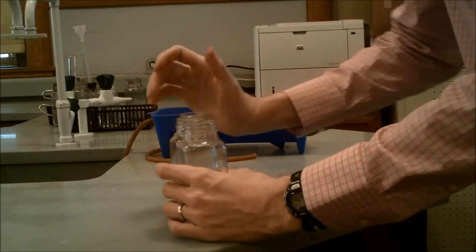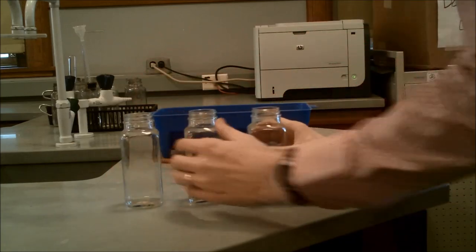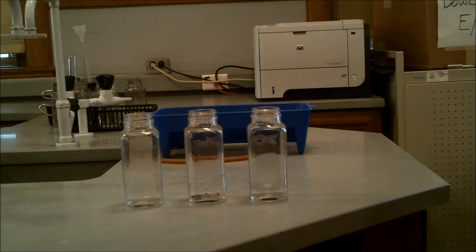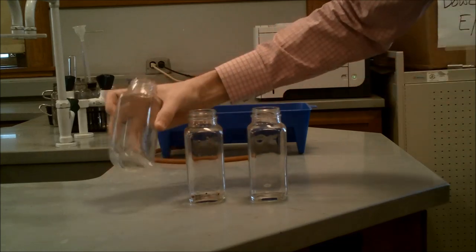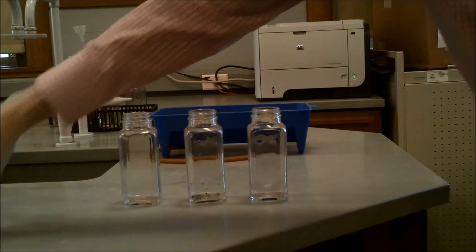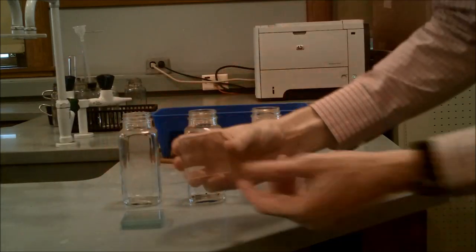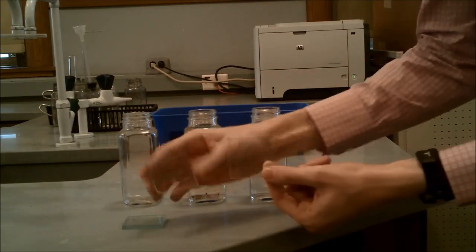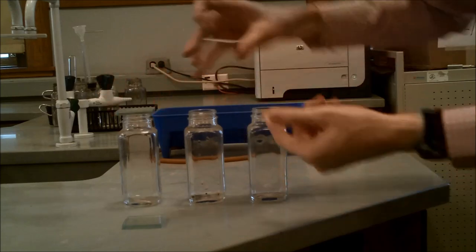The next is the gas collection bottles, the rectangular shaped ones. These will be the ones that you'll fill up completely with water and submerge in the reaction trough. The glass squares are what you're going to use to cover them up so that we can turn them upside down without losing any water.